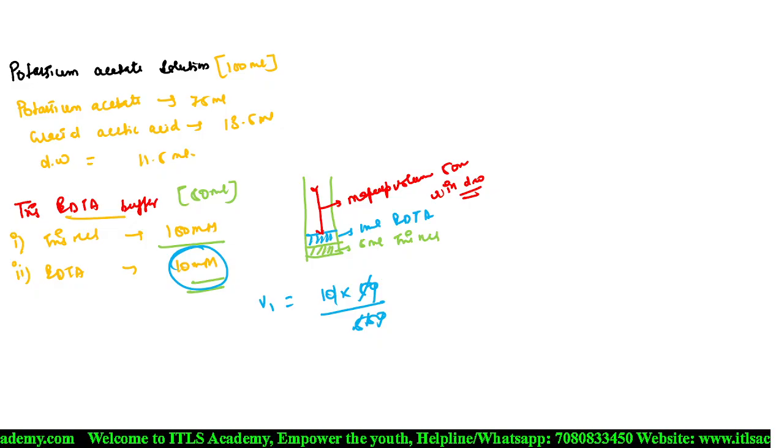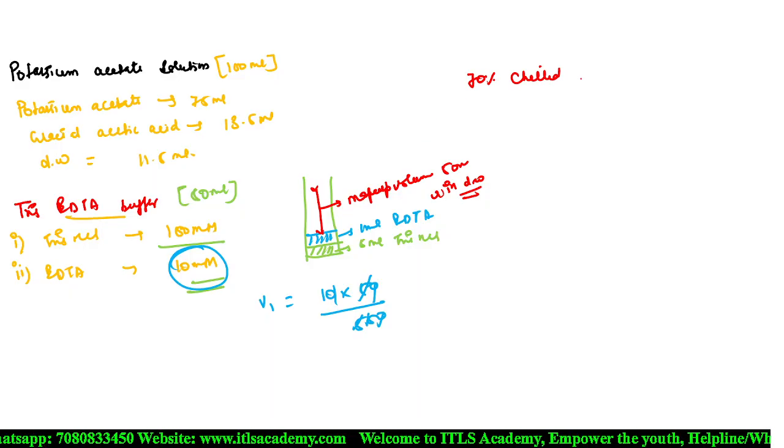Now, the last chemical that we require, which is not to be prepared but we require, is your 70% ethanol. 70% ethanol, okay? Clear?